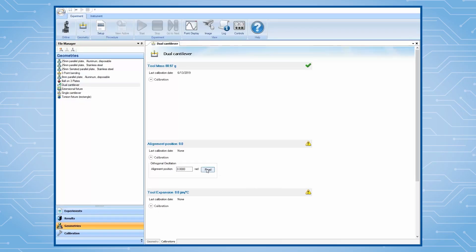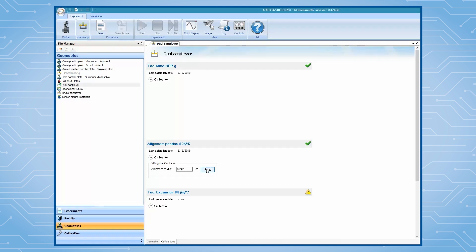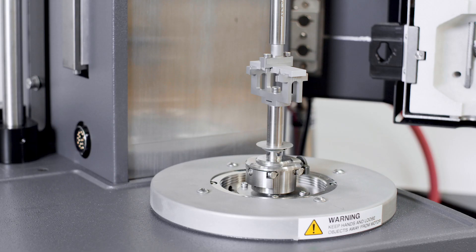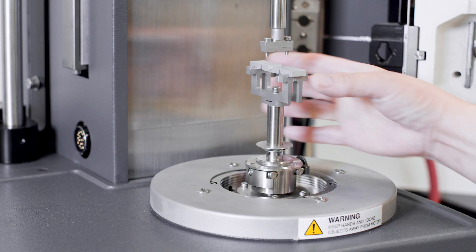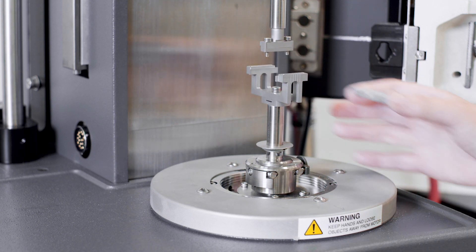Use TRIO software to read the alignment position through the geometry calibration. Once finished, raise the instrument head and remove the alignment tool.